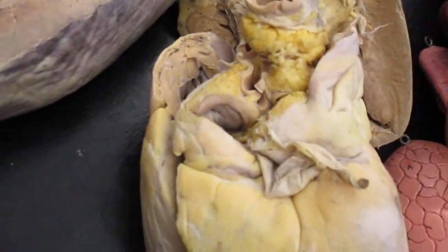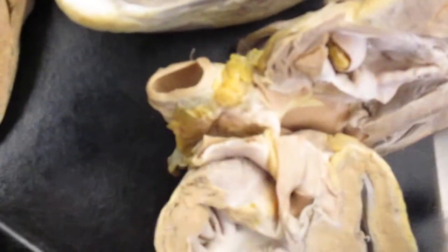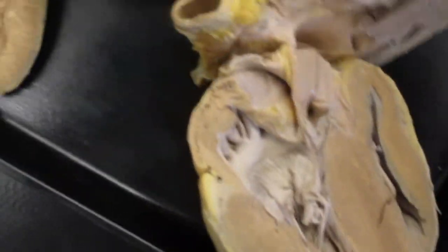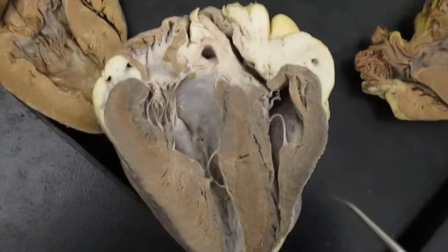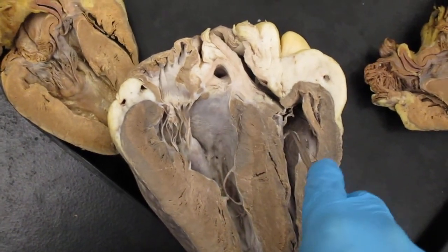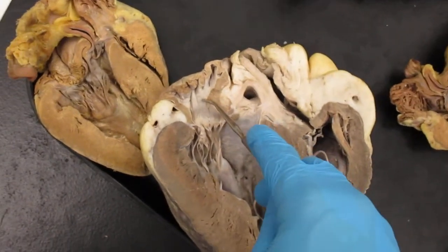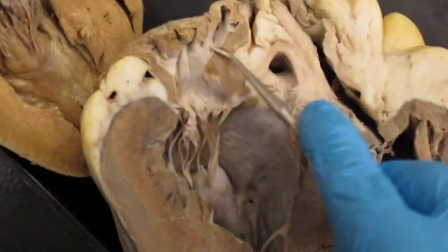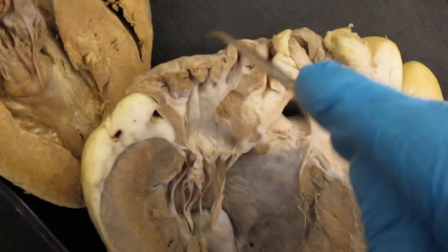Okay, let's move on to the internal heart now. So here's your internal heart. The left side of the heart is always bigger than the right side when you open it up. We have this structure here, which is your dog ear, your auricle, your left auricle.